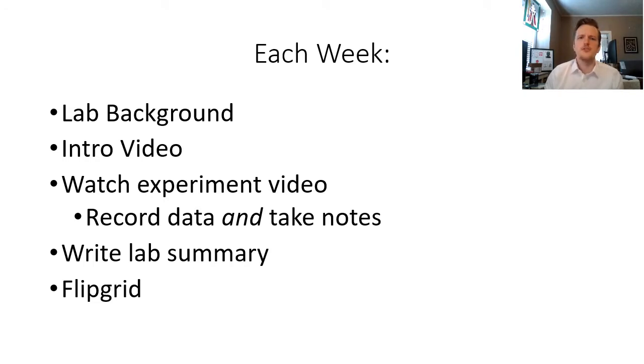What color changes are you seeing? What procedures are going on that maybe you want to ask for clarity on? Just don't write down the data and skip through everything else, because watching it is going to be important so that you understand what's going on.